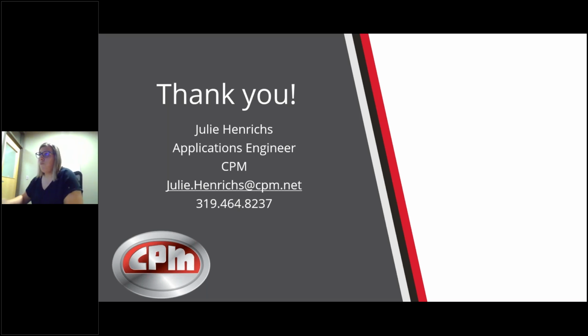Hey, thanks, Julie. A couple quick questions here already. I've got a couple based on the same topic, and that's sieving agent. The question is basically, what's the importance of it, which you touched on already in your webinar. The follow-up to it is, if it's not possible to use sieving agent, is there a correction factor that can be considered, or how do you take into account if you are not able to use it?